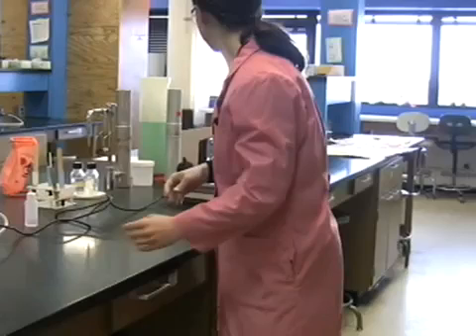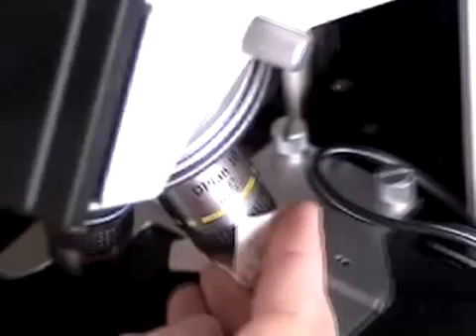You'll notice that if your microscope was stored correctly last time, the cord will be bunched in between the arm and the stage. Never will that cord be wrapped around the arm. So go ahead and begin by removing your cord and plugging it in.